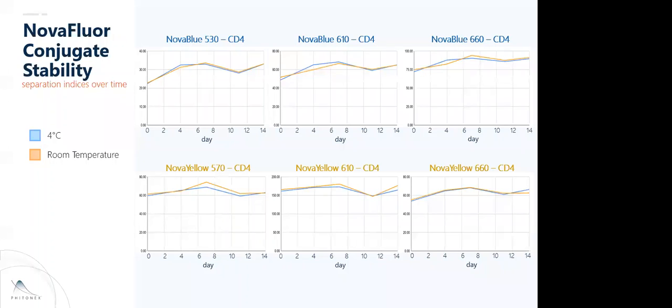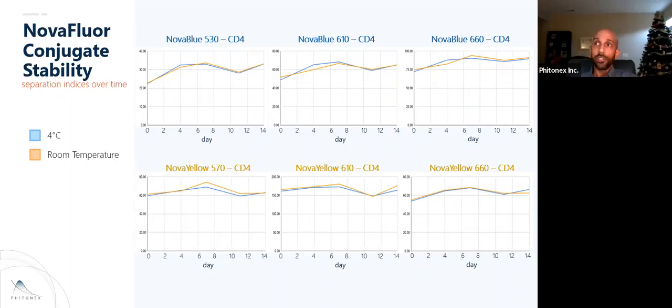So I'm going to interrupt you real quick. We have another question, and some of it we'll be addressing later in the webinar. But what is the cost for getting an antibody conjugated, and is it cheaper to get conjugated to 30S versus 70S? So there's no price difference between the 30S and 70S versions.